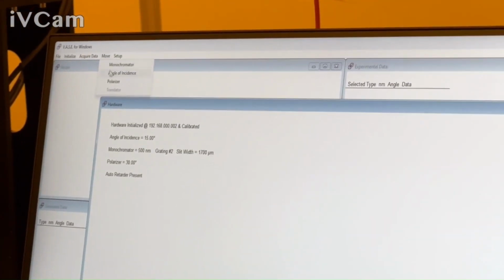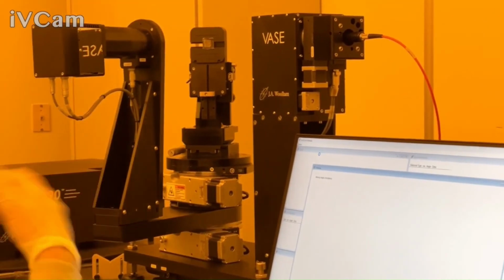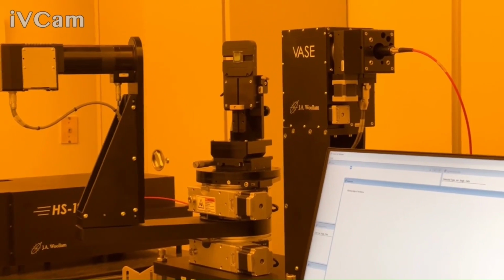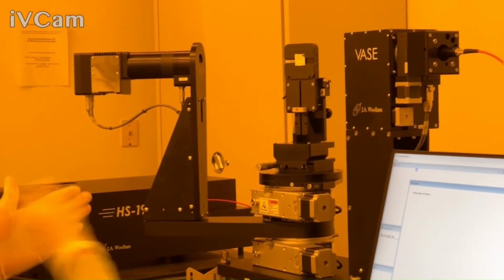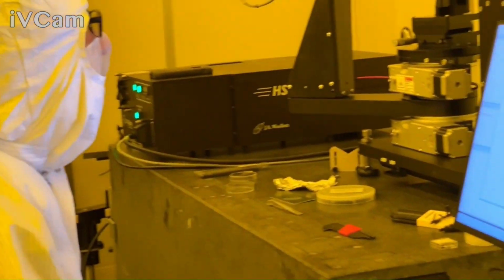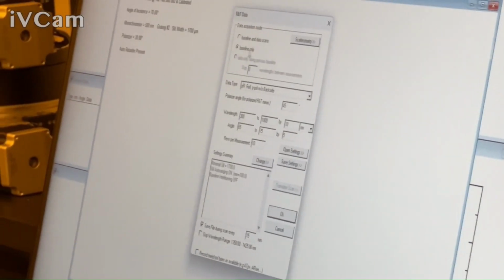I just wanted to check where we were. So what I want to see is, and if this doesn't work, we'll just remove the sample, take a baseline, take a measurement. At the moment, I'm going to measure the baseline of air, which isn't going to be angular dependent because there's no sample. What I don't know is if it's going to let me do that in reflection mode, where I'm going to probably have to call it 90 degrees. We're going to check because this might work, this might not work. It's not usually the way I would run it, but I'm going to try baseline only.